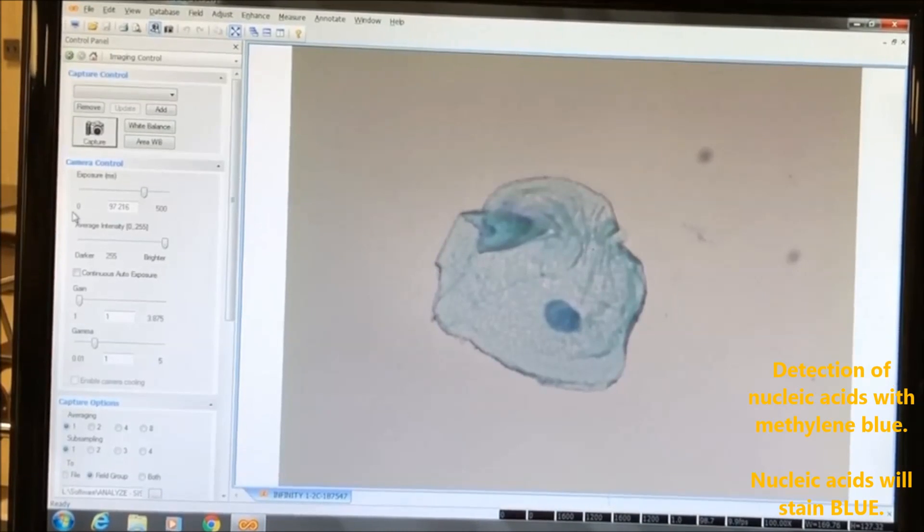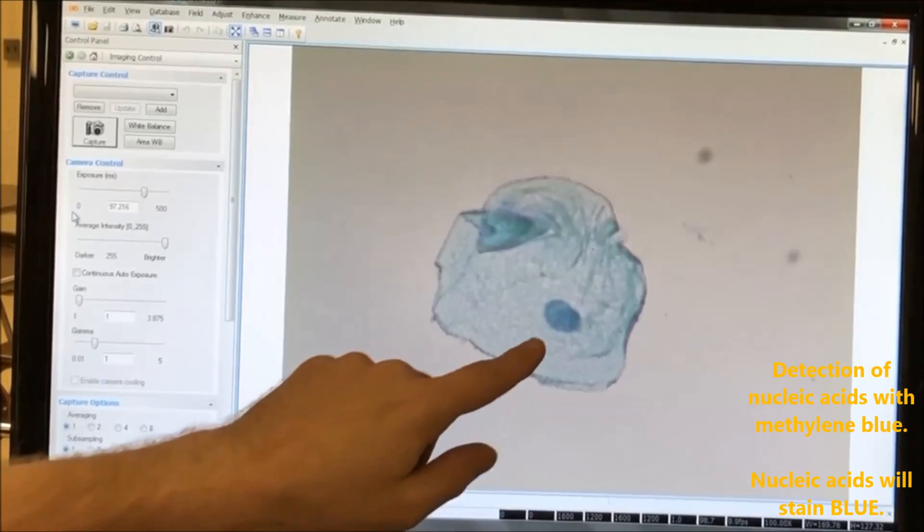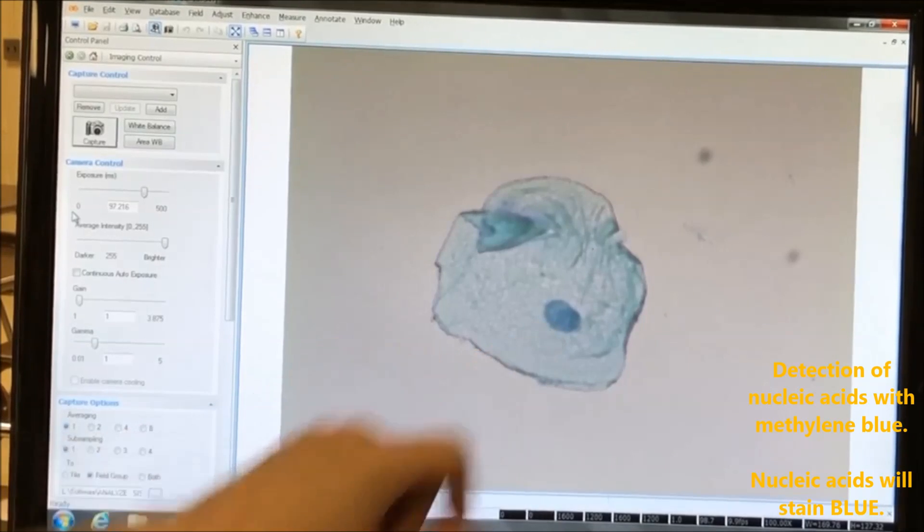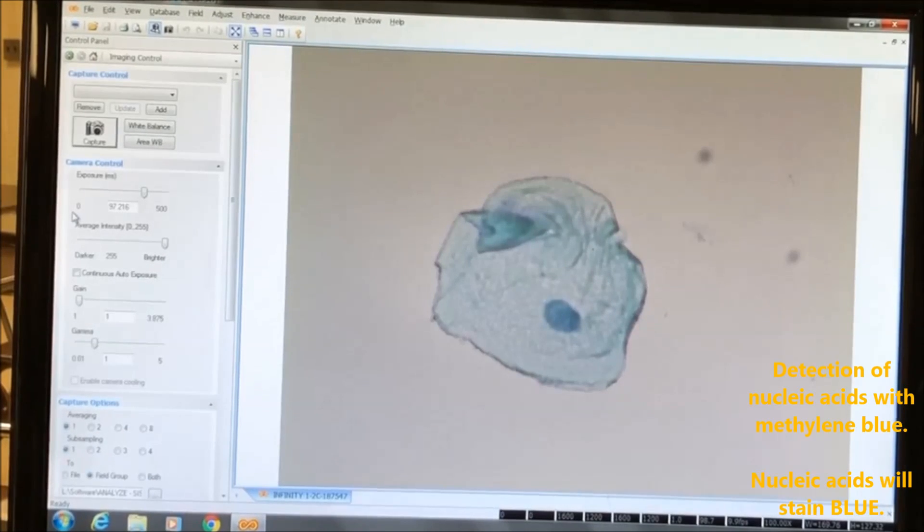So here we see one of my cheek cells. And as you can see, the nucleus here has stained blue because of the methylene blue. Methylene blue, again, stains for nucleic acids. Hence why our nucleus is blue because it contains DNA.